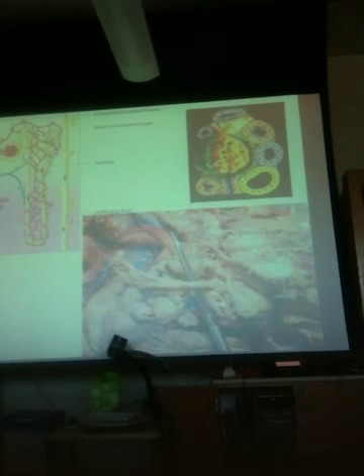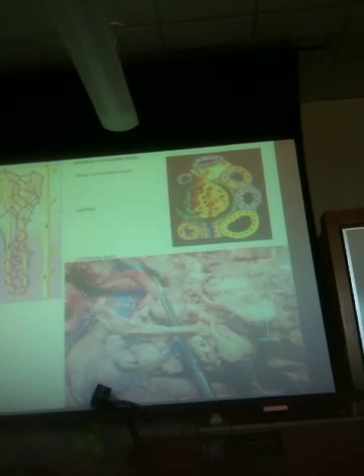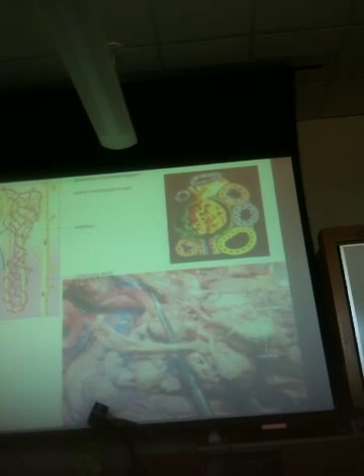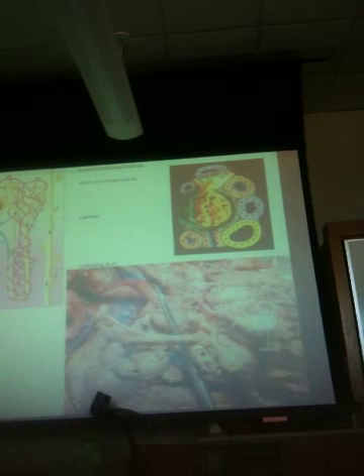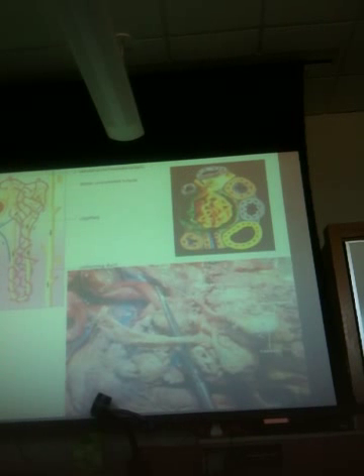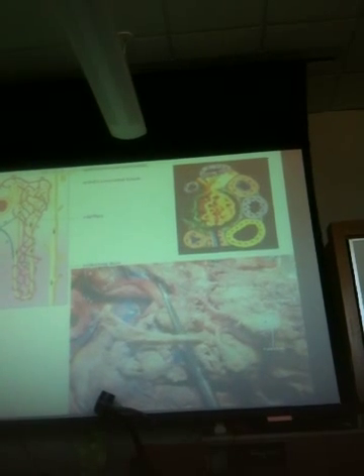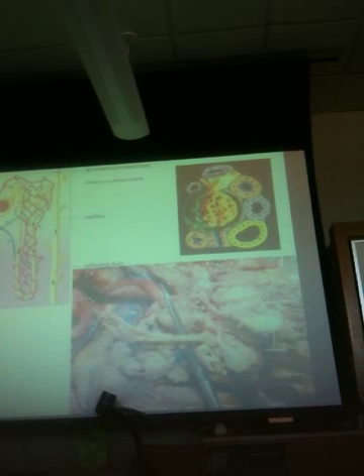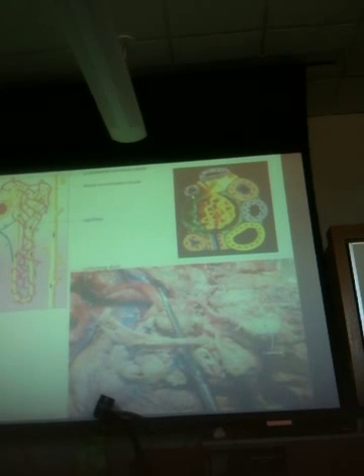And then up here, although you really can't tell the difference, you've got the afferent and efferent arteriole. You can't really see the difference well on the two. What is this purple tubule right here? It's right in front of where the afferent and efferent come together. This is the DCT. Actually, this is a loop of Henle right over there. This is a good view of simple squamous right there.